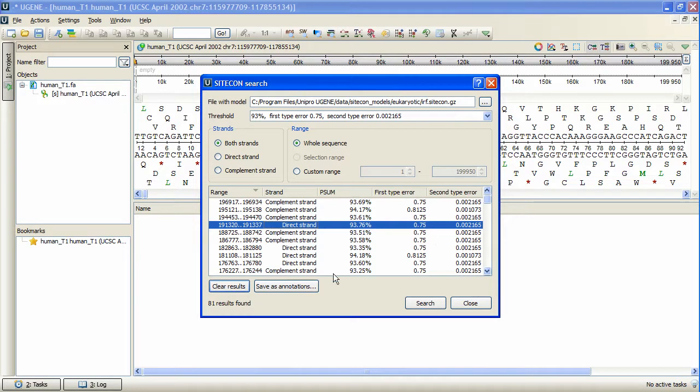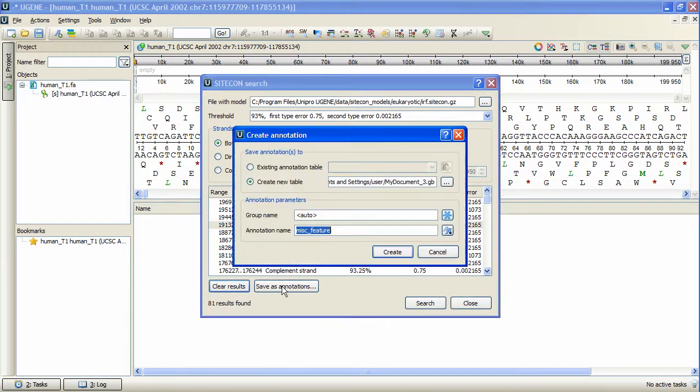To browse the results as sequence annotations, press Save as annotations, and specify the annotations table to contain the resulting annotations.